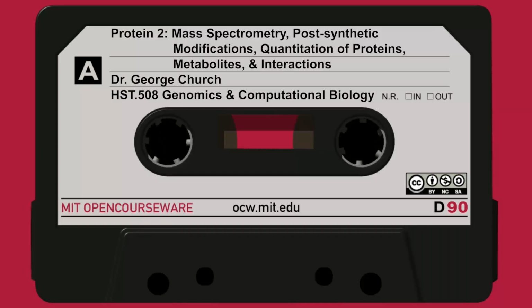Now, there are two ways to approach this awesome amount of data that you can get out of these. Remember, you got all these multi-dimensions finally ending in this forest of B ions and Y ions and all the rest of it in there. And there are two approaches. One is, we'll call it de novo peptide sequencing, which would be analogous to the de novo DNA sequencing that we were doing. And the other is, if you tell me the sequence, then I'll find it in my data. It's doing a database search, where you're limited to finding peptides that you already know about or can hypothesize from a genome sequence.